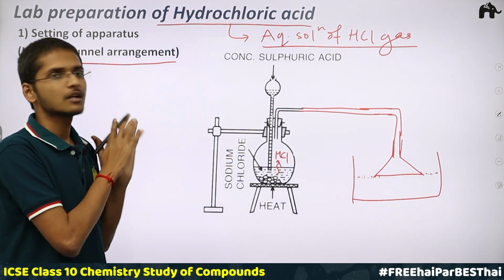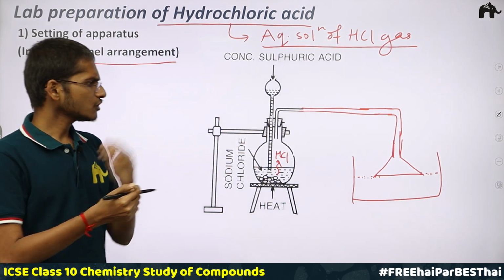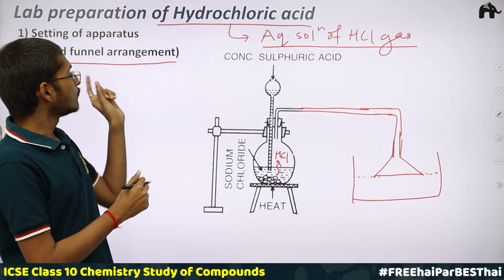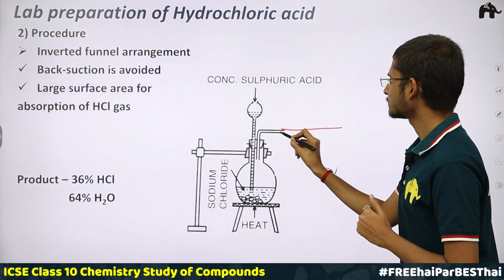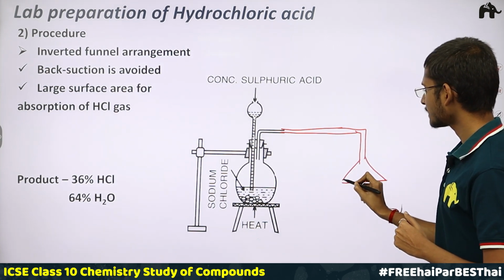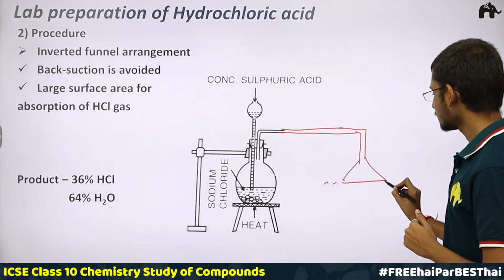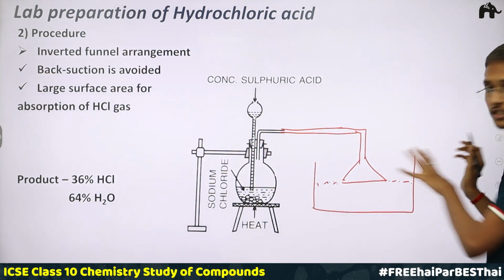Okay, they have asked this question in your exams, not several times, but they have asked it. So now let's see ahead, what is the procedure. Again, I will make the delivery tube and connect it with a funnel, and arrange this funnel in such a way that it just touches the surface of the water.